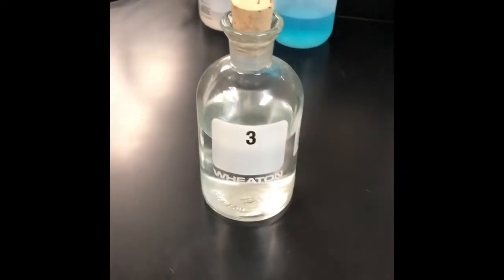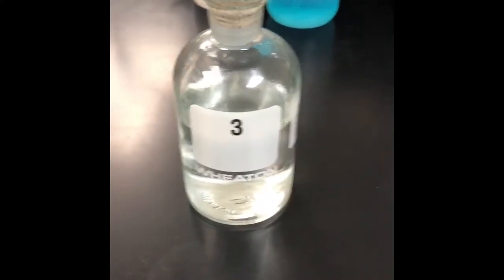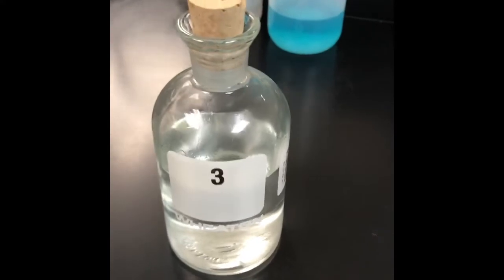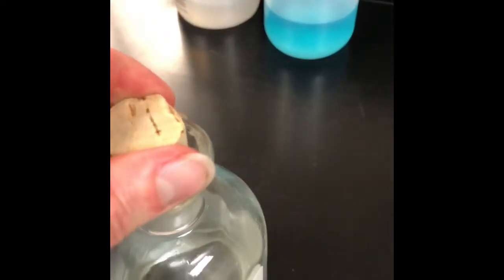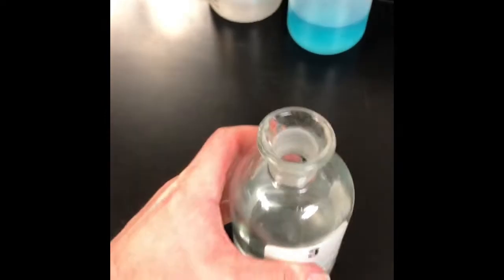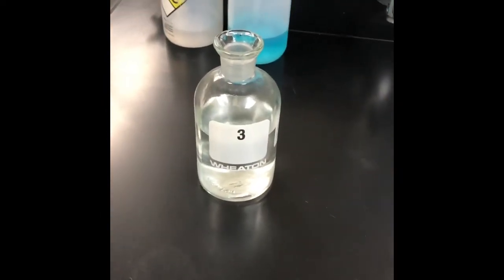The last part of this lab is to find the density of an unknown substance, an unknown liquid. We're going to be dealing with liquid number 3 and liquid number 12. Just by smelling this, a little waft, it smells like it's going to be vinegar. So we should get something really close to the density of vinegar.